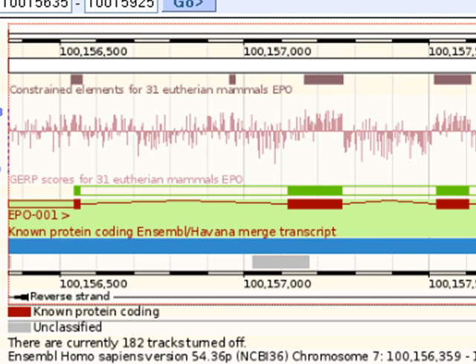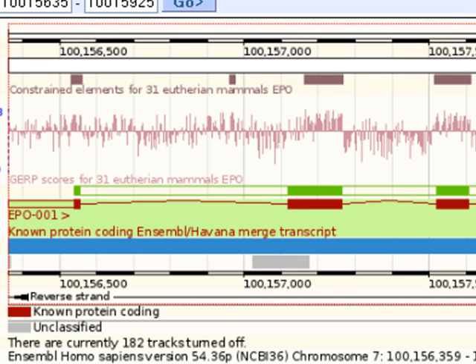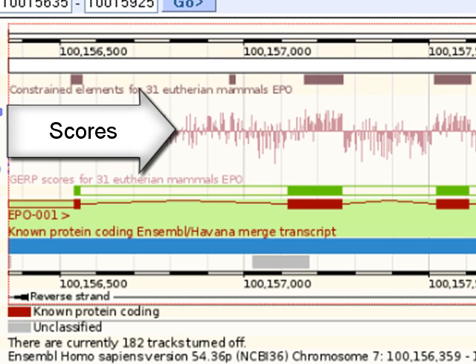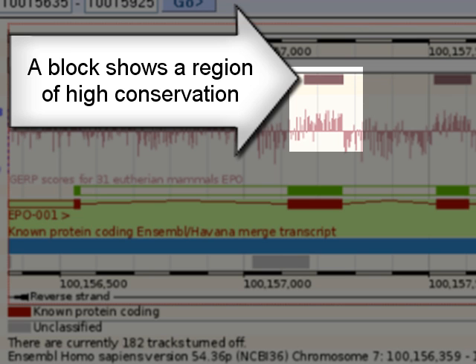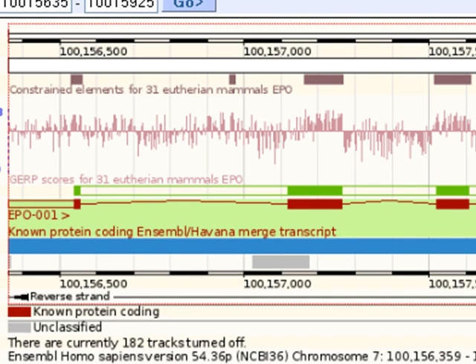We have the 31-way multi-species alignments and a GERP score is applied to each nucleotide. The score can be seen in this plot. If there's a block of high-scoring nucleotides, it's shown above — these are the most highly conserved nucleotides in the 31-way alignments.